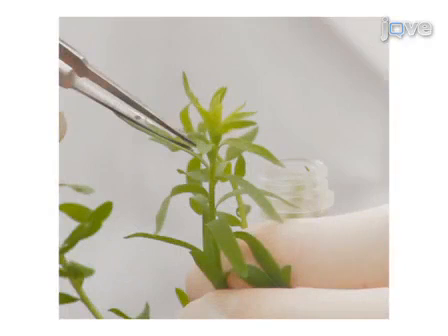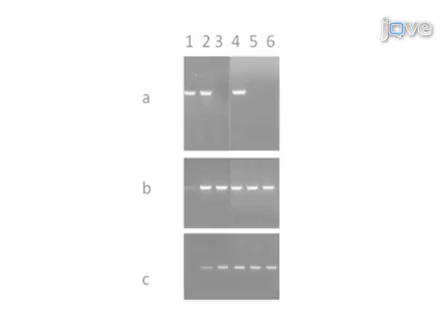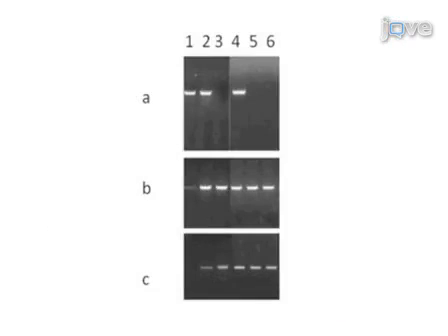Leaf and meristem tissue is then collected at various times during the growth of the plants under the various environments. Next, DNA and RNA are isolated from the tissue samples. The final step of the procedure is to perform PCR using the DNA samples and qRT-PCR using the isolated RNA to identify genomic changes and gene expression changes resulting from growth under different environmental conditions.